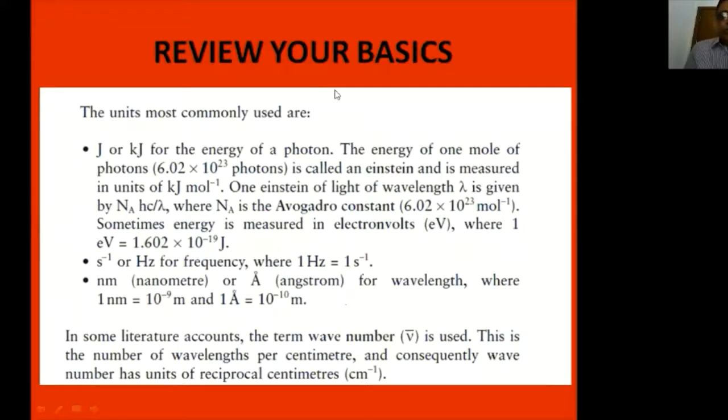Now you can use these energy units. You can also use the wavelength in units of nanometer. We can also relate nanometer to the angstrom. You know, angstrom is the olden unit. SI units are nanometer. So you should have all these relationships.